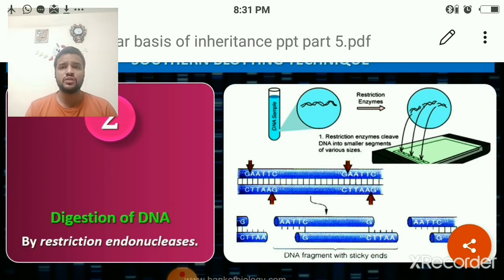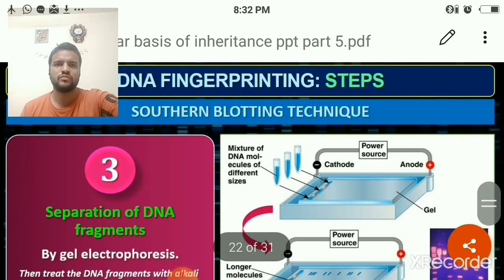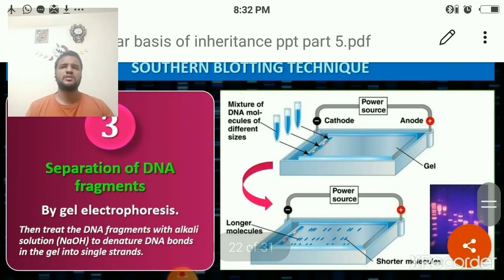In detail about restriction endonuclease, we are going to study in the unit on biotechnology. Okay, so the whole DNA is now divided into fragments. That is called digestion of DNA, with the help of restriction endonucleases. Next, the third step is separation of DNA fragments.